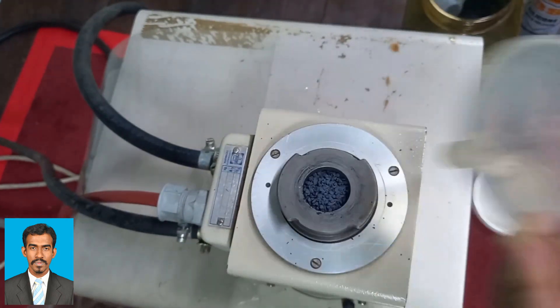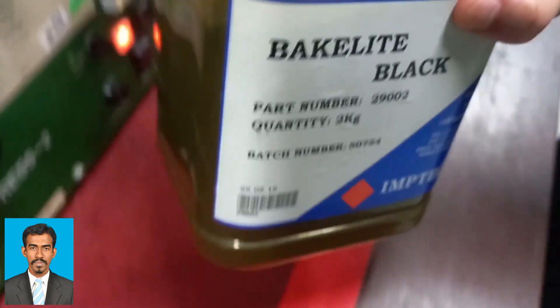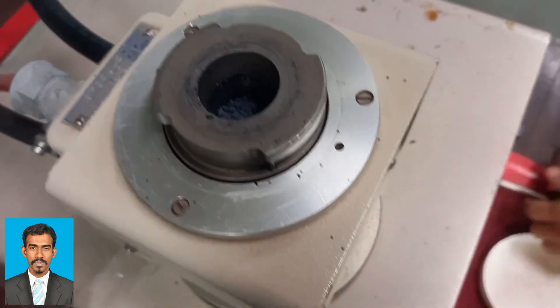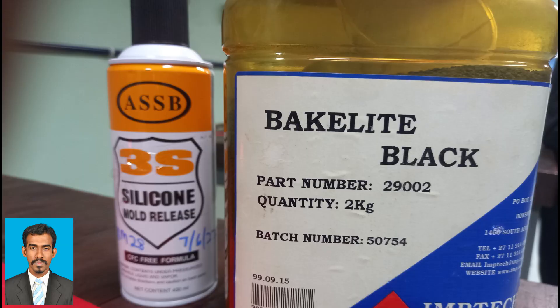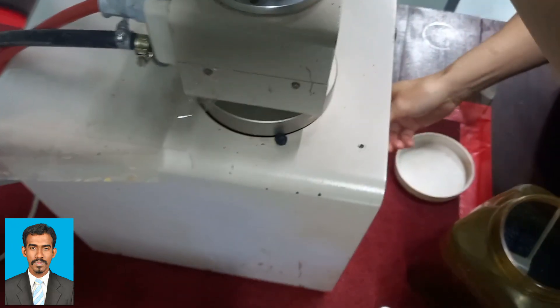Once you put sufficient molding resin, lower the sample holder by pressing the down button. Then spray the mold release spray on the mold cap as well as within the surface of the mold. In this case, silicone spray is used.